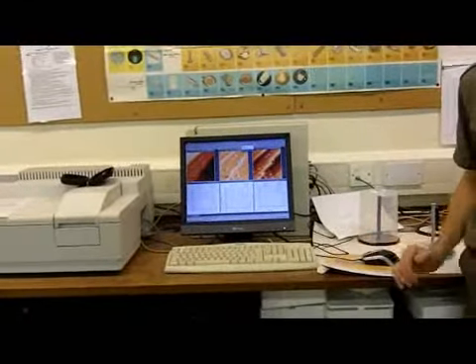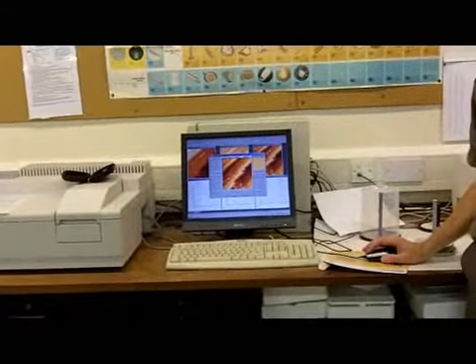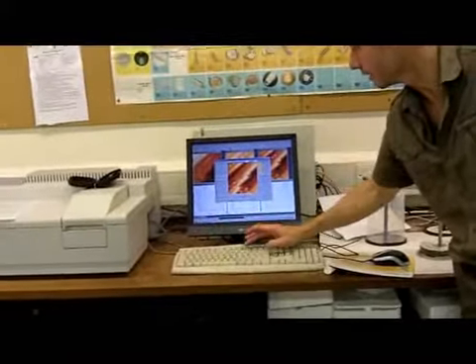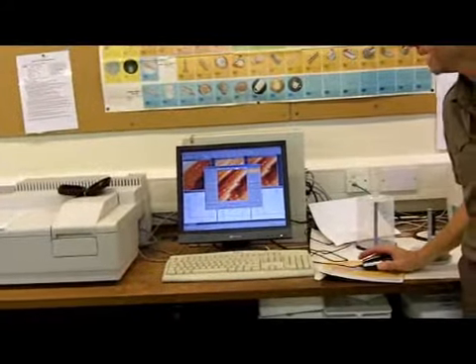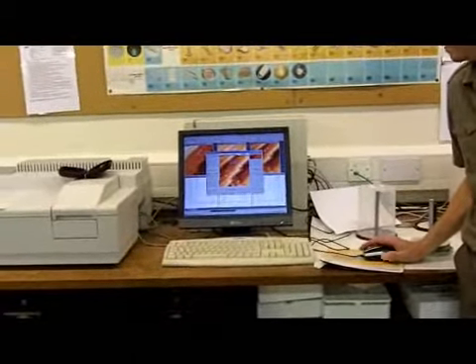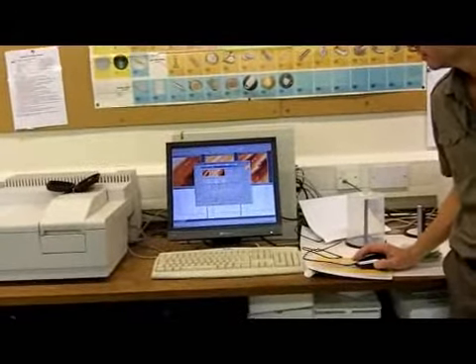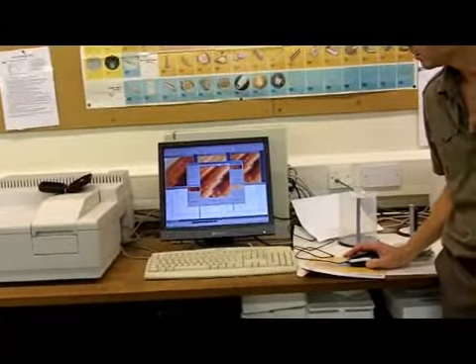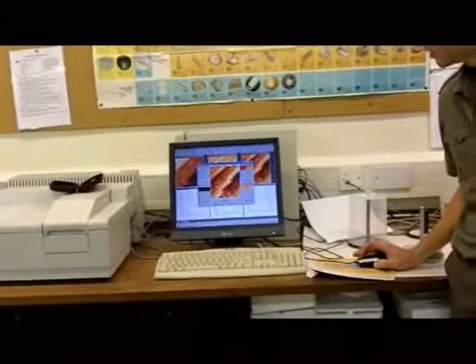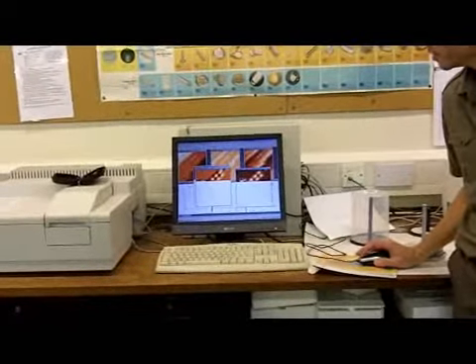Or there's multiple dynamic zoom, which is the one I'll choose for the moment, where you can dictate the size of the box. So we'll take it as 30, I think, and 10. So I'm going to have a rectangular box, just for the fun of it. I can select multiple images, which I'll do. And I choose where I want to take my image. Let's suppose it's down there. Click on the screen, and then say OK. And you can see we've got 3 zoomed in images.